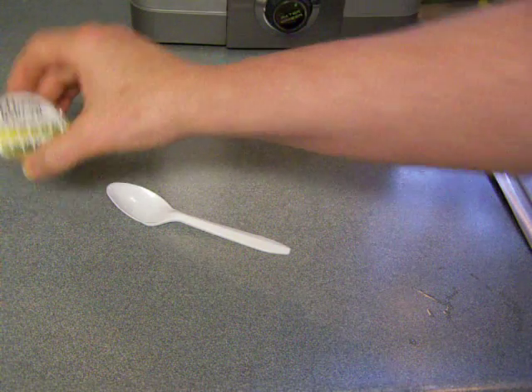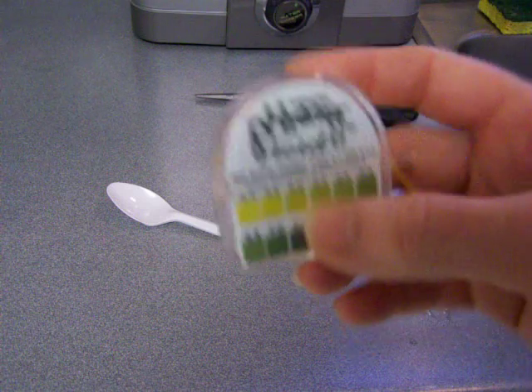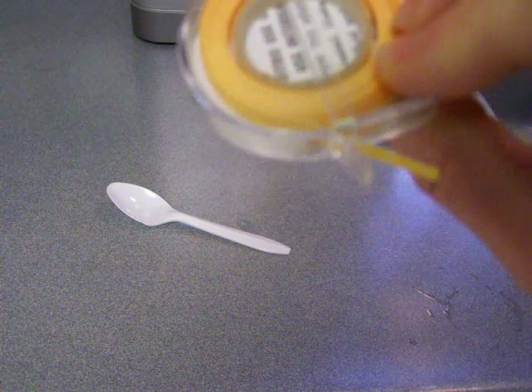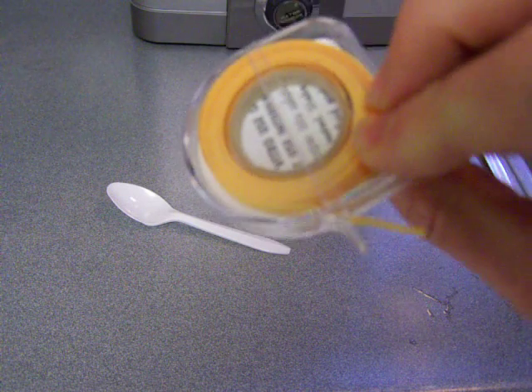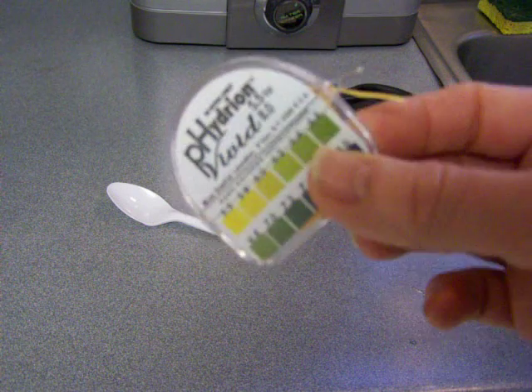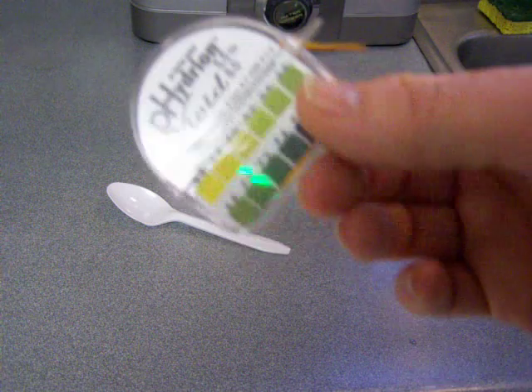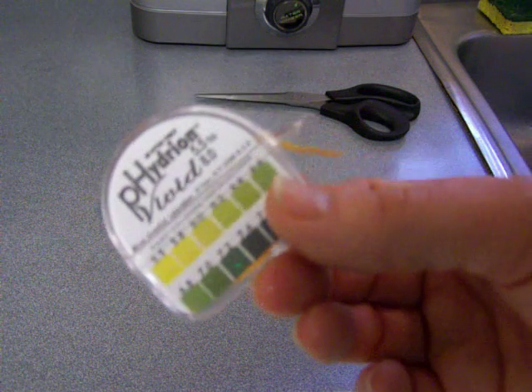I'm going to show you a simple little test that I do with pH paper. This is a roll of paper that's probably about three yards. I like this rather than the pH testing strips because I really get a lot more out of this roll than what their directions tell you.